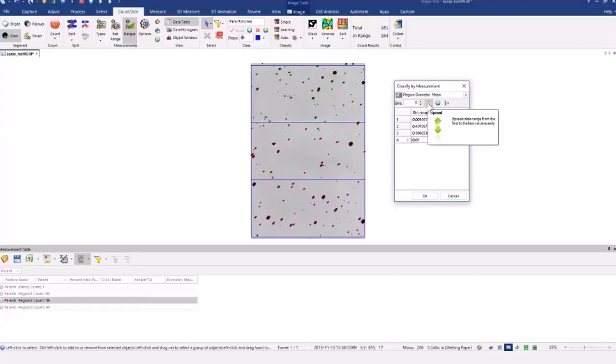So I know, just by looking at the data table, the maximum mean diameter of any of these particles within here is 0.07. That will exclude any of these parent objects. And this is where the spread data is. If I had a standard SOP, I could enter my own fixed bin ranges here. I'm just going to do it for sake of demonstration. We spread it. My min and max now stay the same for my entering. And I can call this small, medium, and large.